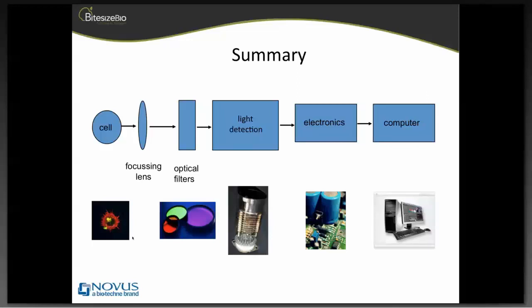I have a question here too. What is the minimum threshold value? My machines are the BD machines, the LSR2 and the Fortessa. It tends to be set on 5,000, but I don't actually know what that 5,000 corresponds to as the threshold lowest level. On a Caliber, it's the lowest level. The set level is 52. Okay, so I guess it's just specific to individual instruments.